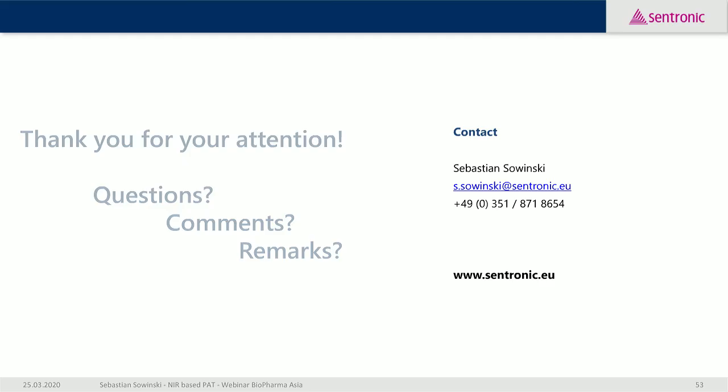Can the PAT-BU tool in Sentronic be used for real-time release testing? Tom, would you like to take this question?